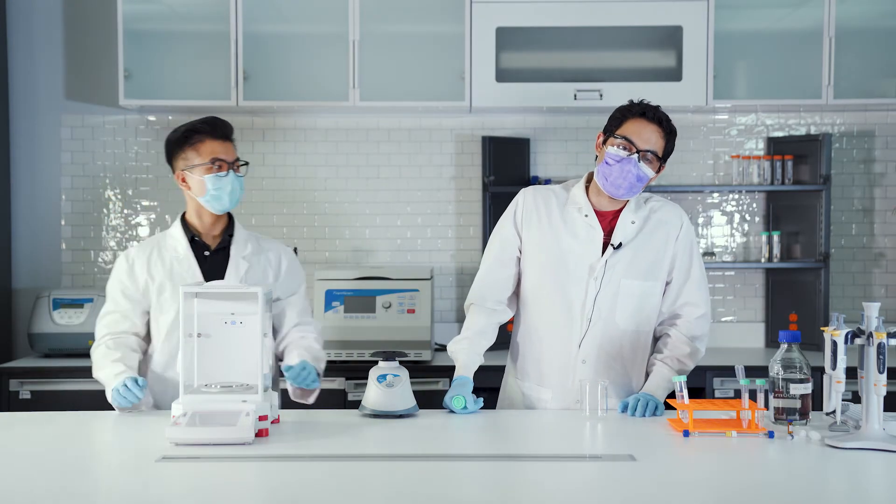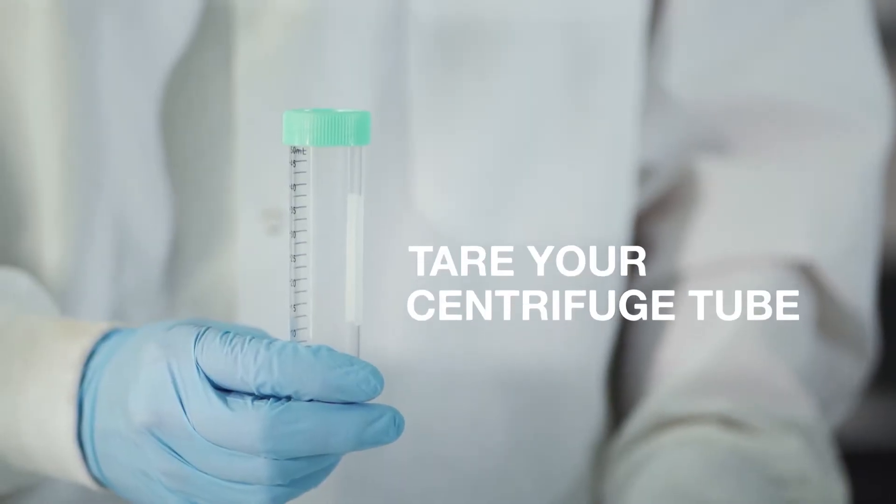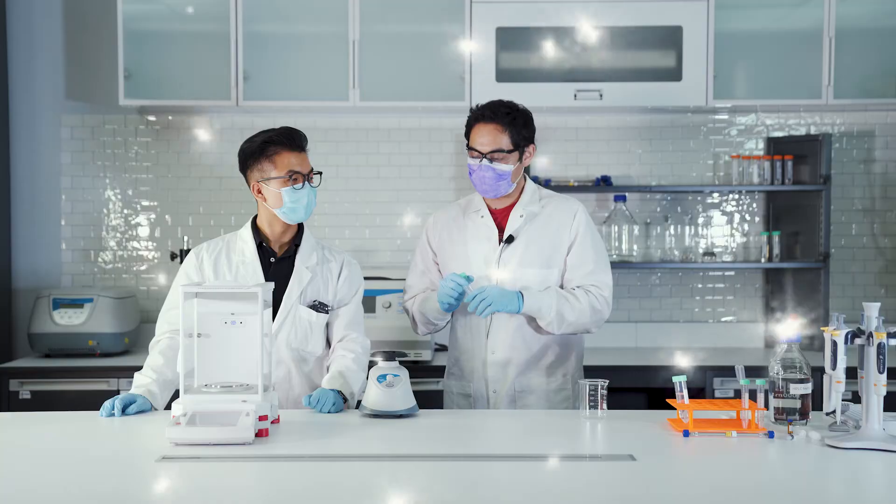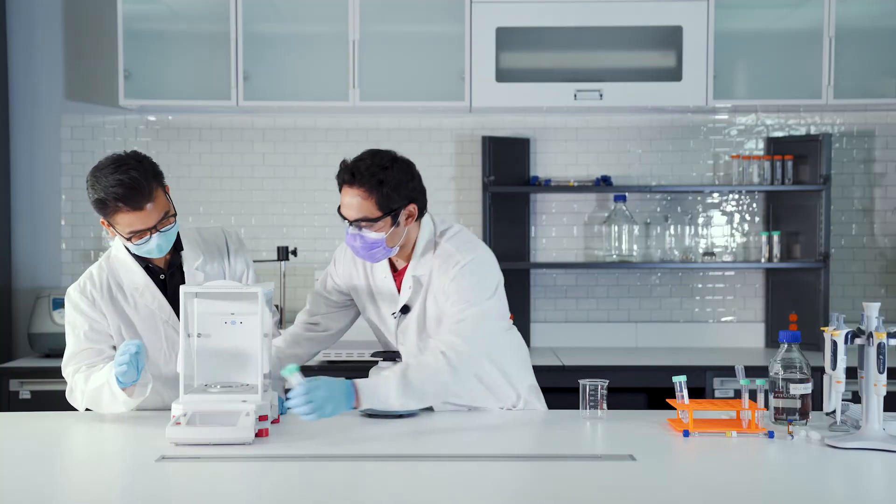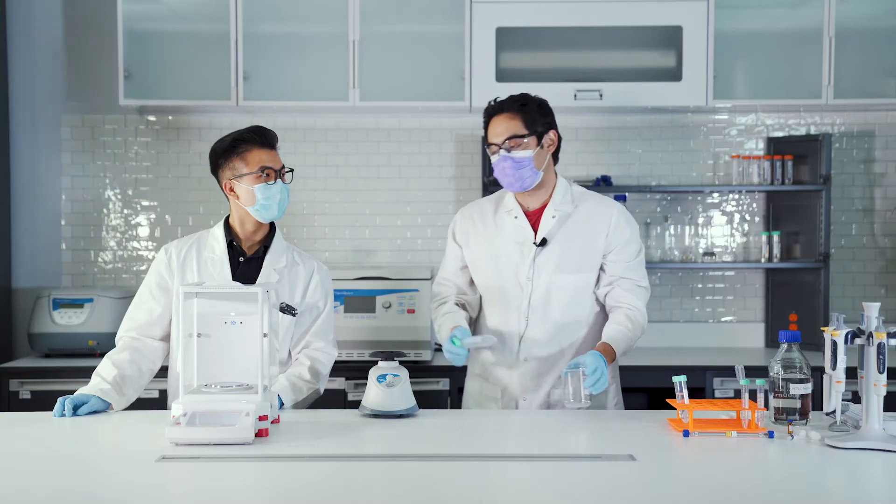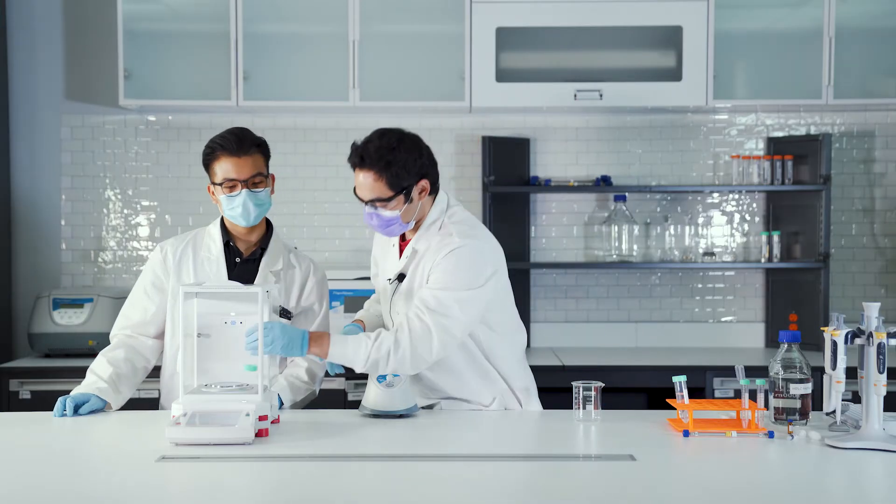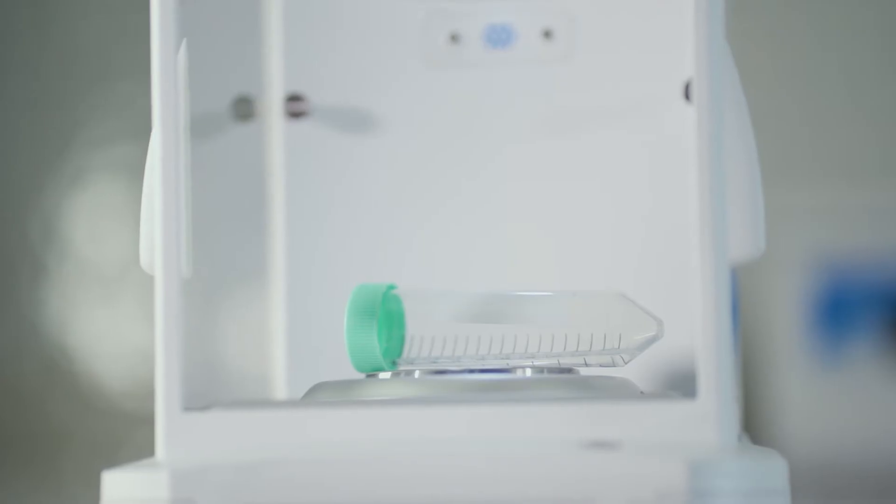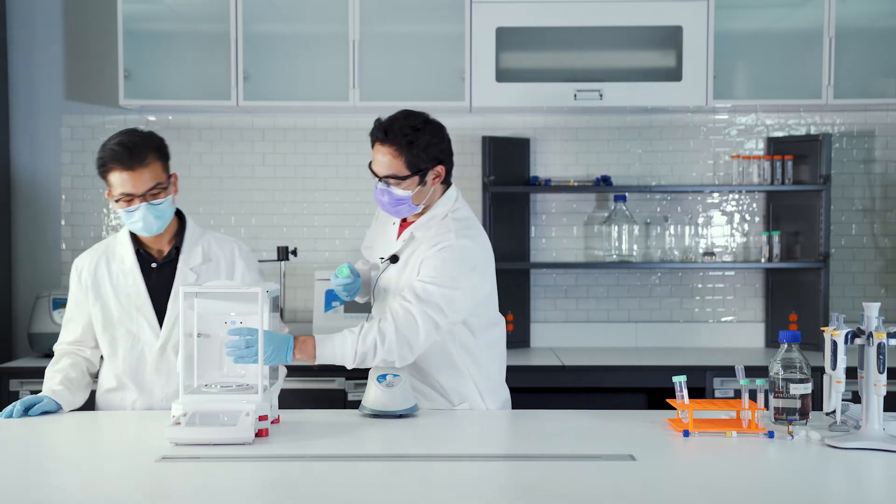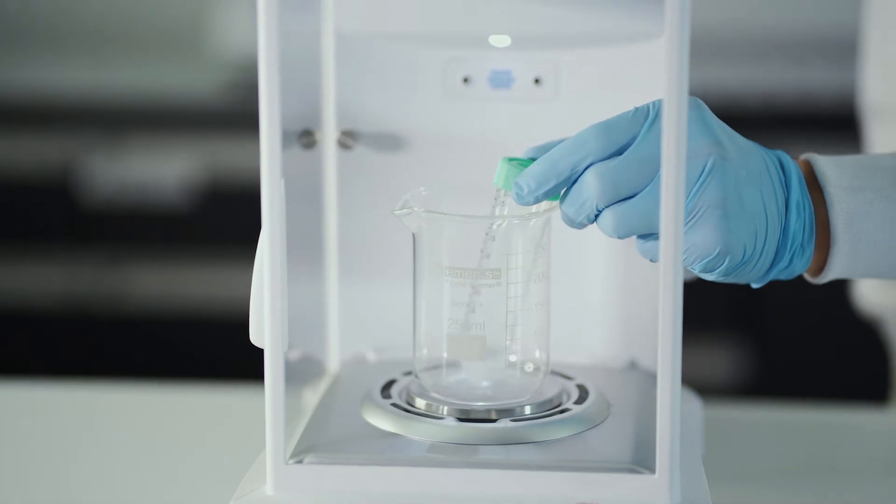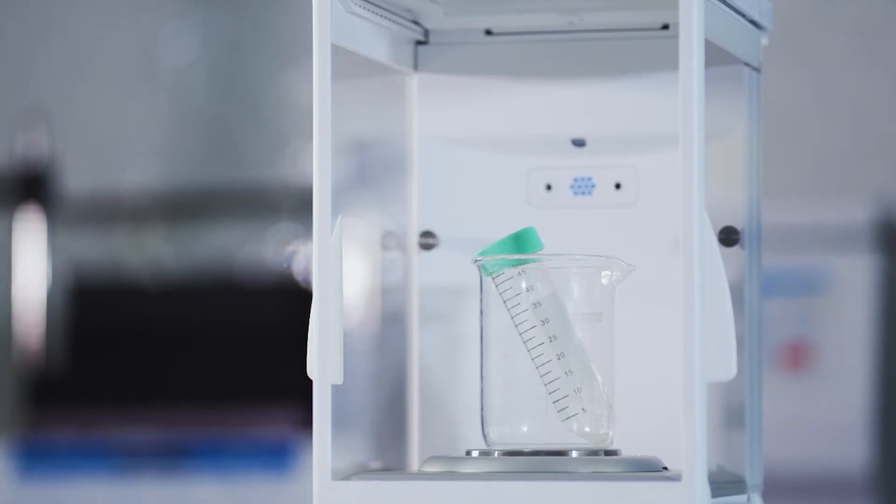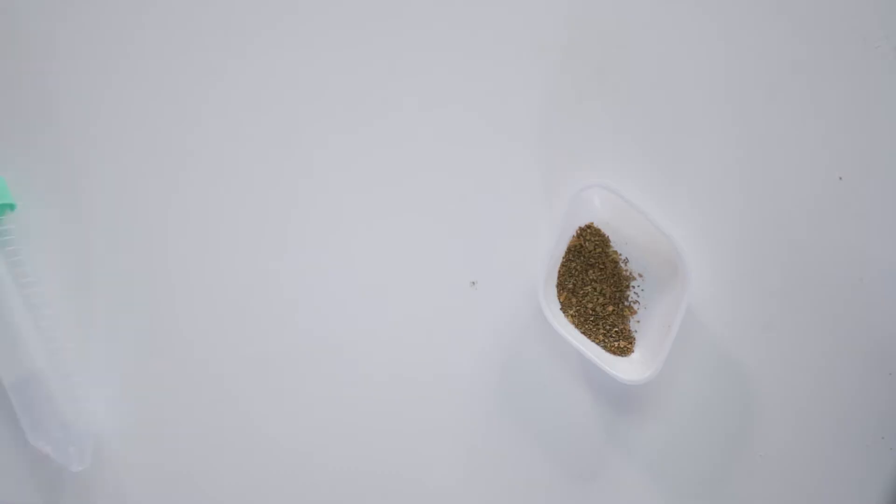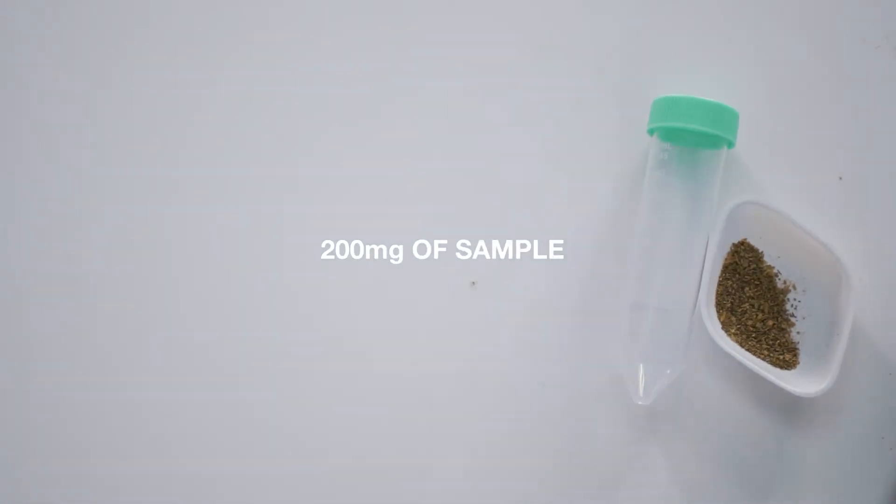The next thing that you'd want to do is tare your centrifuge tube. Lab hack for you: instead of trying to tare your centrifuge tube like this, get a beaker, put that in there, and boom, you can tare it that way.